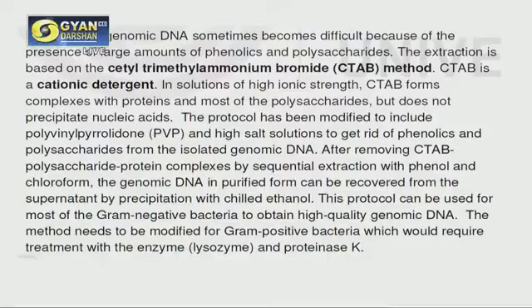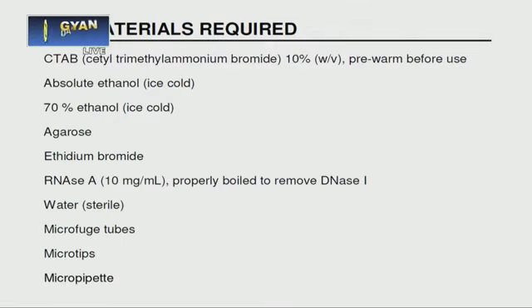Alternately, you can also use isopropanol for precipitating the DNA or the nucleic acids. Now, you can follow this protocol for the bacteria also, because today we are mostly talking about the isolation of genomic DNA from the bacterial cells. So what are the materials required for this experiment?